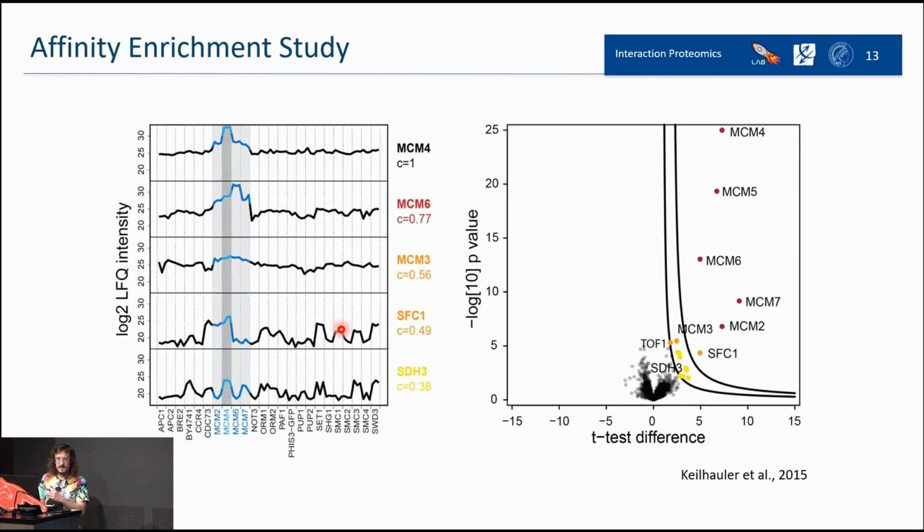So when they are binding unspecifically, the profile plot should be different in every condition. While here, they check the similarity, the correlation between the different profile plots for that specific protein. And here, then, they further verified with the t-test difference for that specific bait and specific binder.